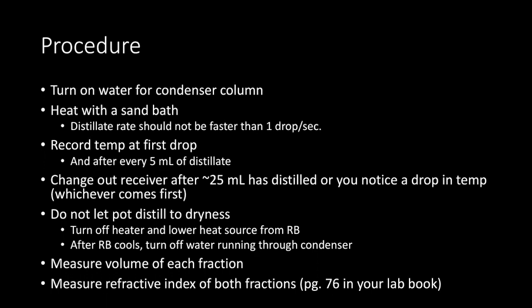You will want to change out your receiver after approximately 25 milliliters of distillate has come off, or when you notice a drop in temperature, whichever one comes first. Obviously, if you notice a drop in temperature, you'll probably want to bump up the heat on your sand bath just a little bit to get your second material to distill off.